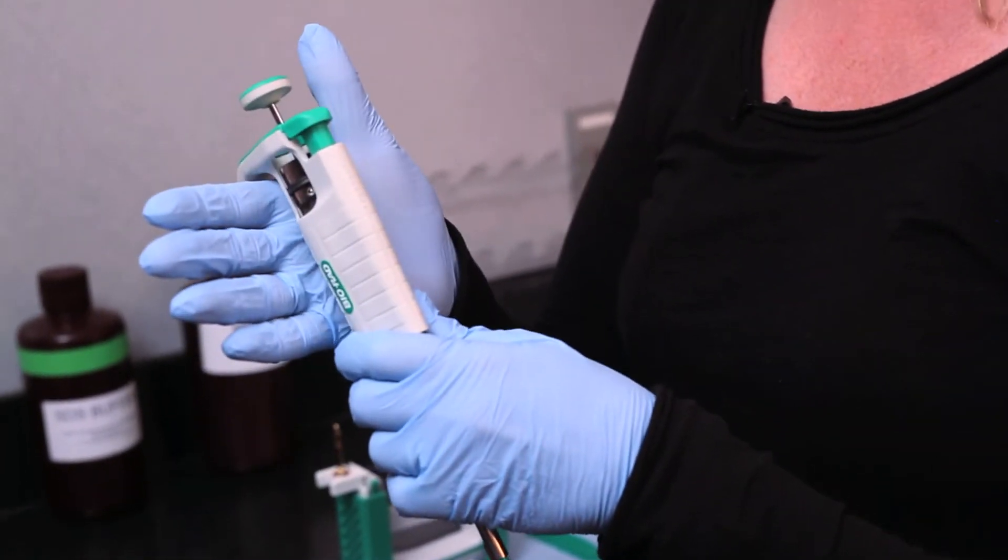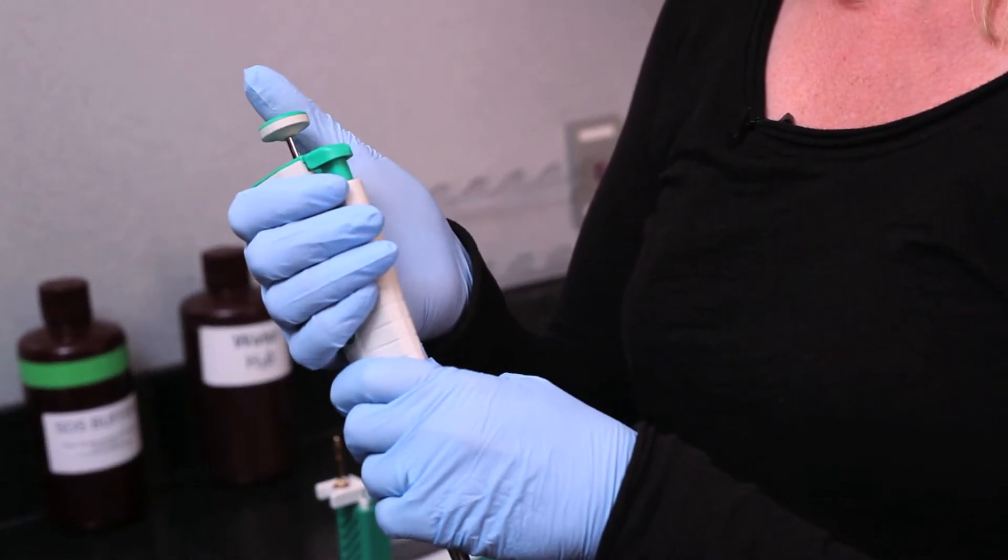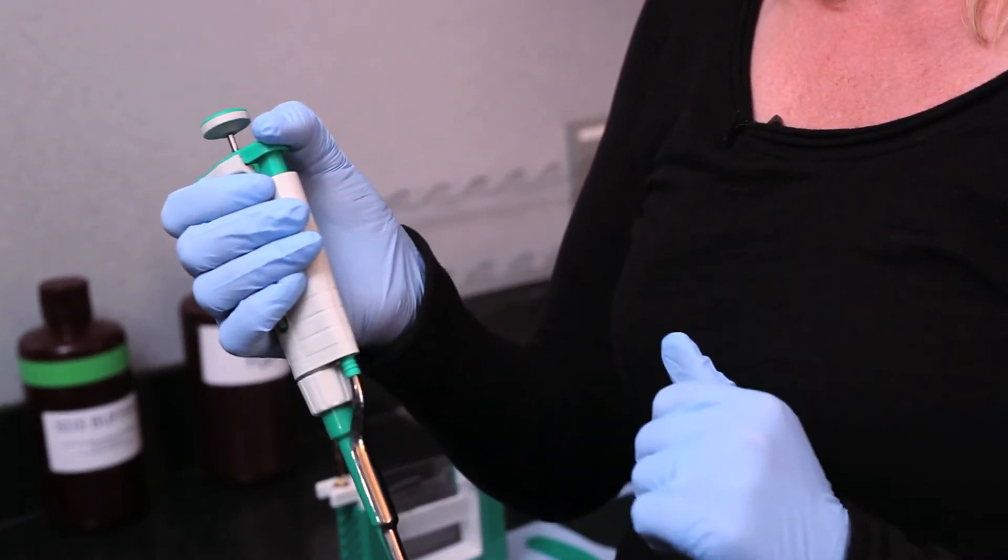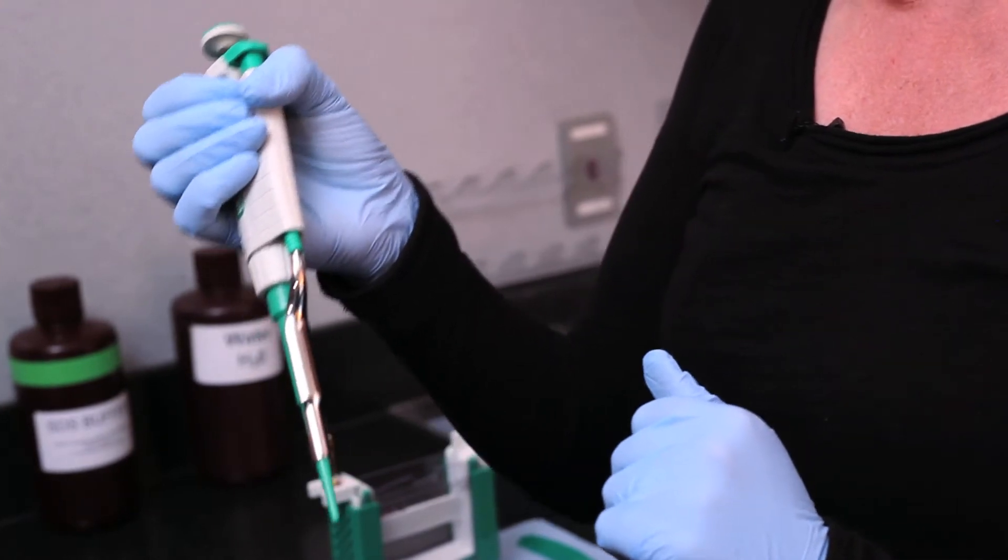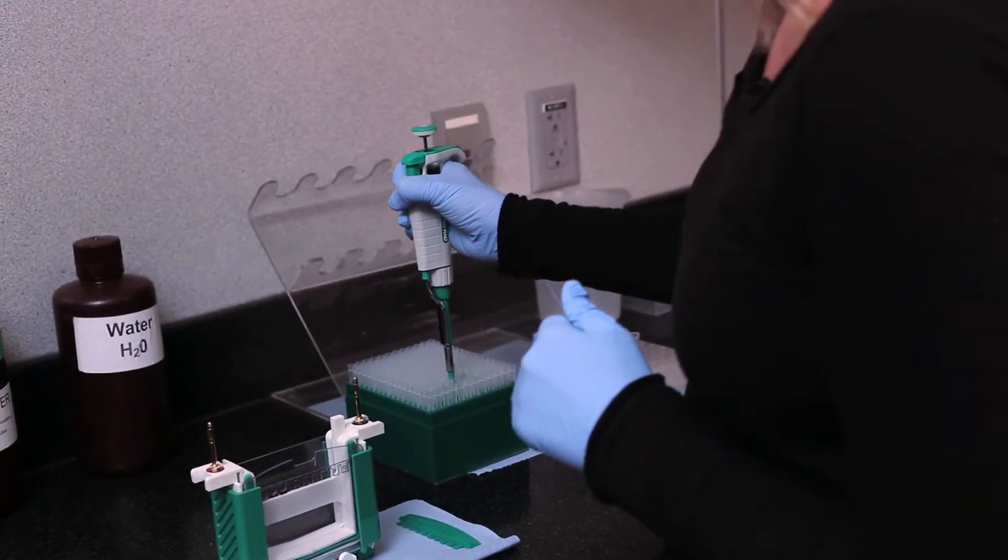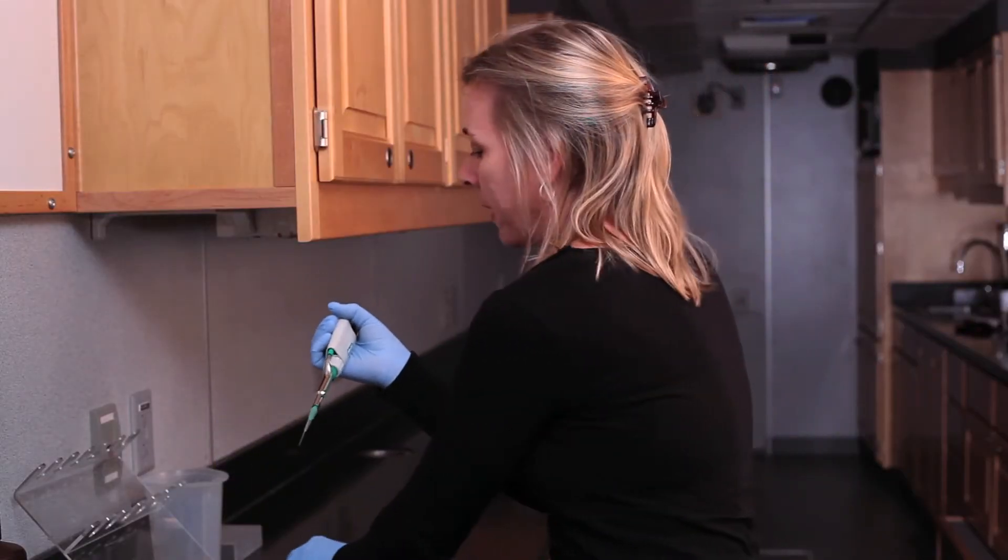I'm going to place my pipette in my hand so that my thumb can access both the plunger button as well as the eject button. The first thing I'm going to do is place a pipette tip onto my pipette and then I'm going to pick up my sample.